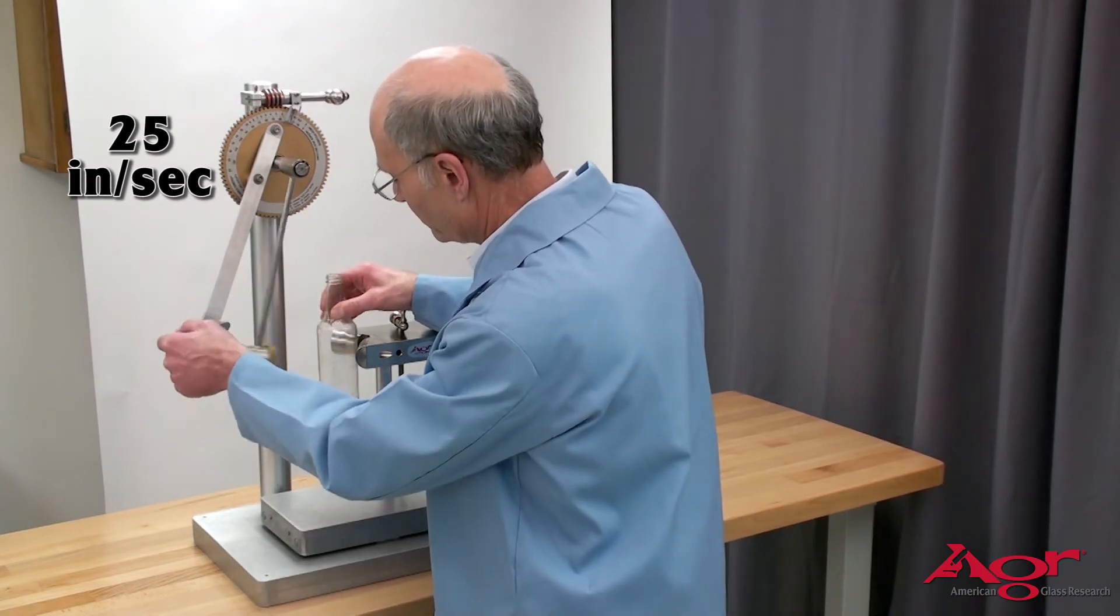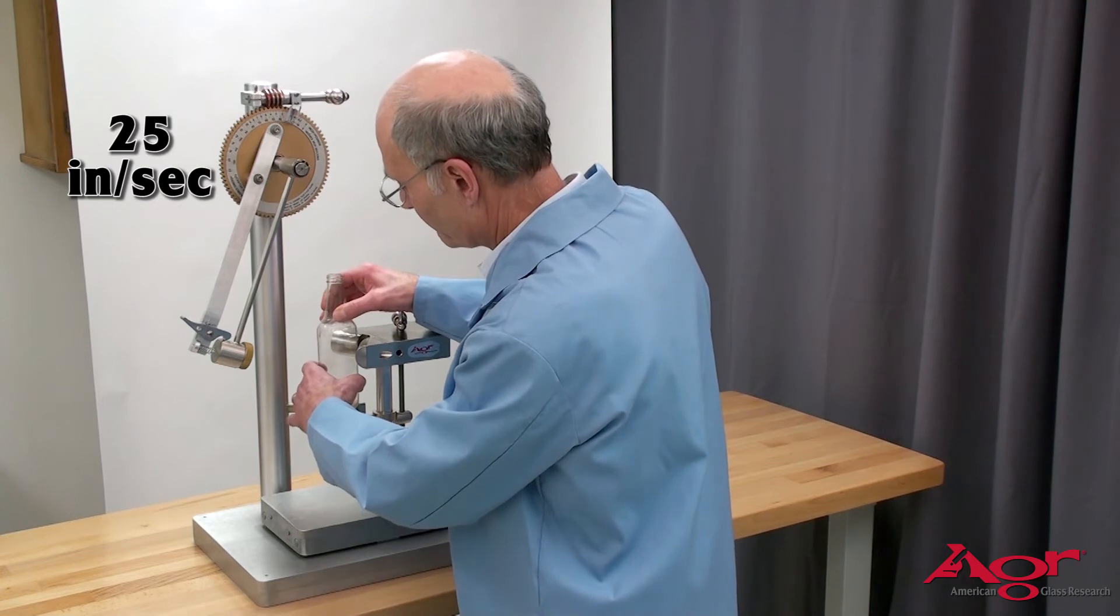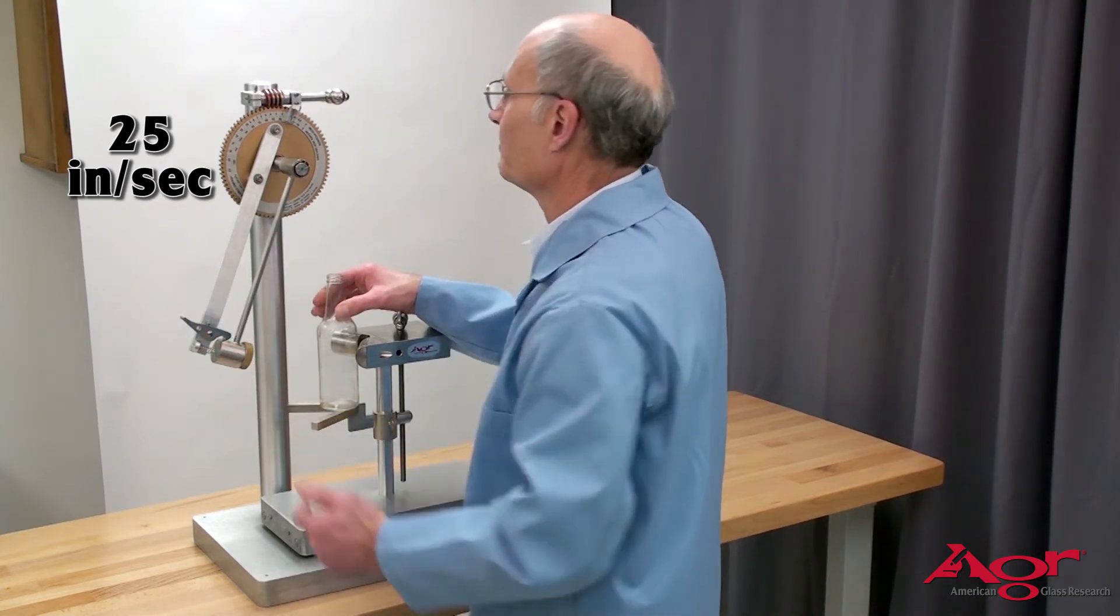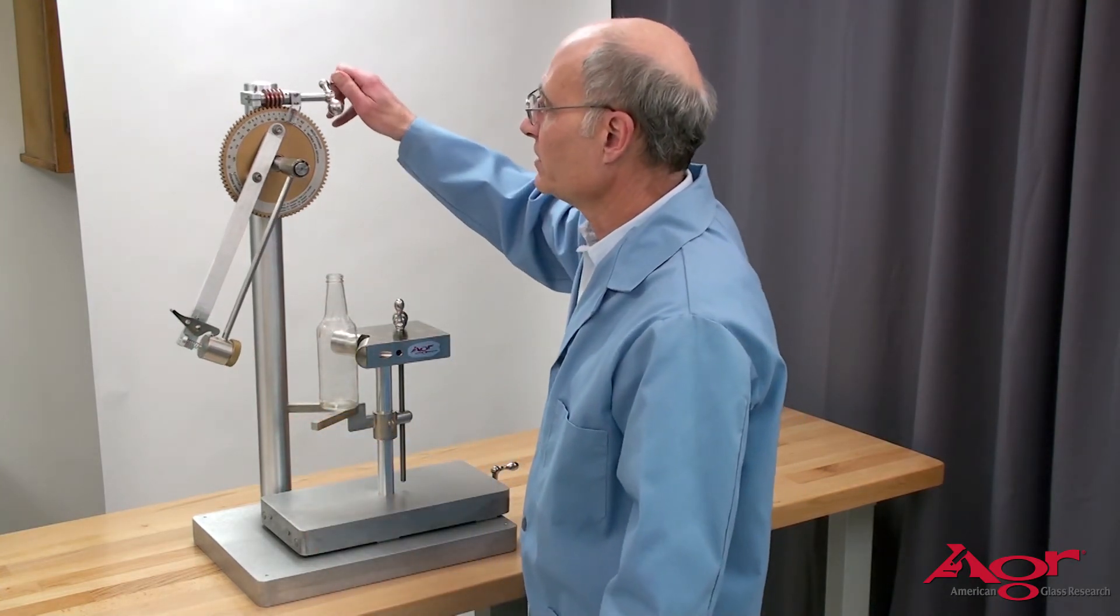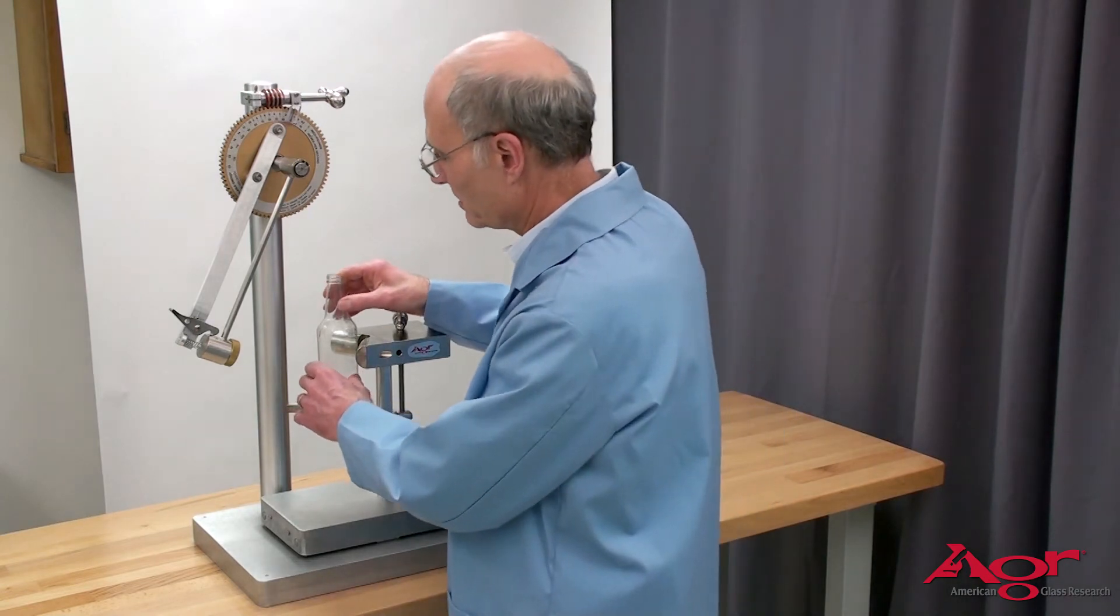One small break, one small break, three times no break. So the bottle is incremented by five inches per second and the test repeated.